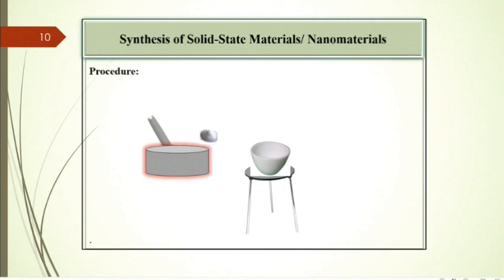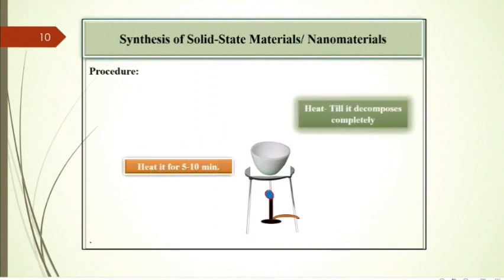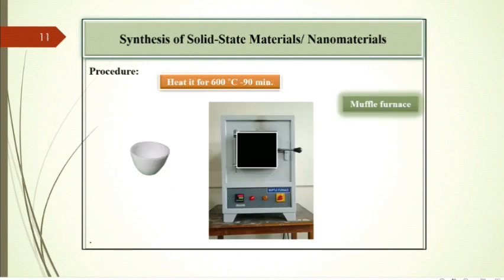After that, transfer the final product into silica crucible and ignite it on a burner till it decomposes completely. It will require 5 to 10 minutes. Then place the crucible in muffle furnace and anneal it at 600 degrees centigrade for 90 minutes.